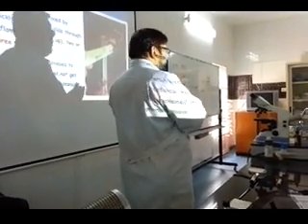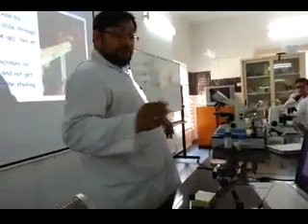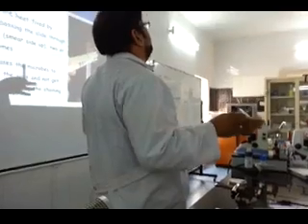In liquid culture, when liquid culture is there, you sterilize your loop, take the liquid culture, take 1 or 2 loops, just mix. No need for water, it's already water.